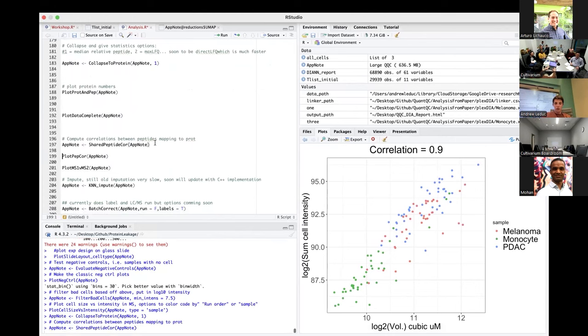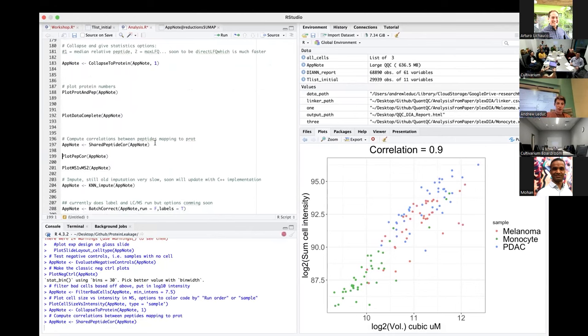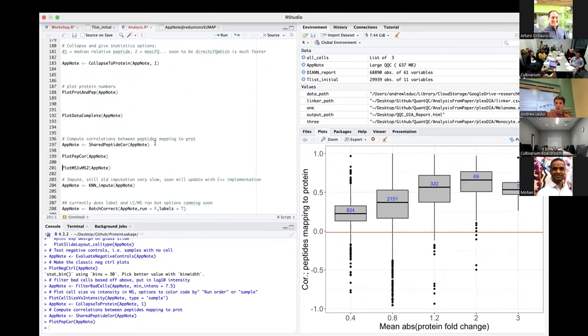This is to remark on a plot that I really like, and I think it's super useful. What we're doing here is correlating peptides that come from the same protein across single cells, and we're faceting each of these distributions by how variable the protein is. If you have a bunch of single cells, and there are two different types of single cells, and you have a protein that's specific to only one of them, it's going to look something like this: high, low, high, low.